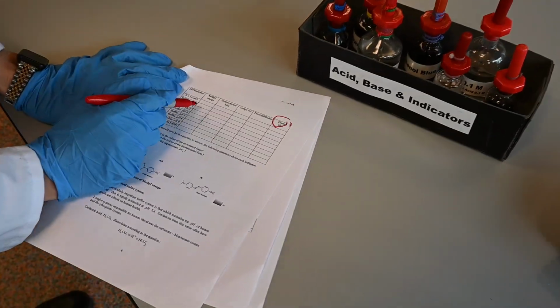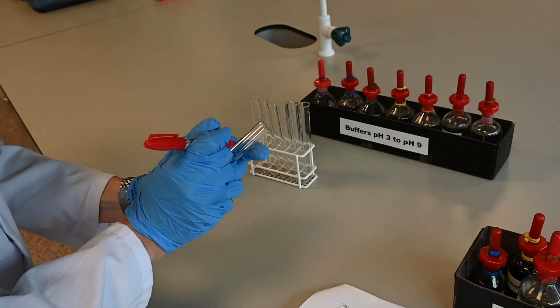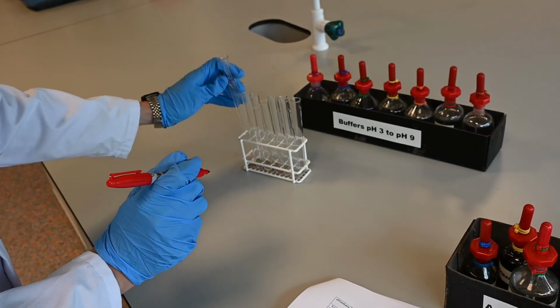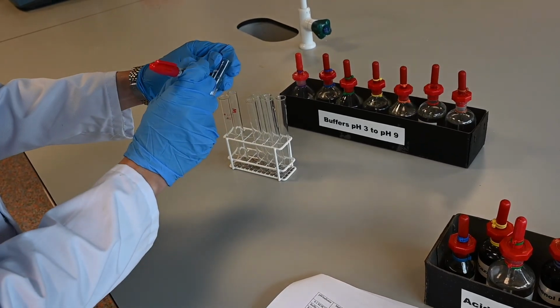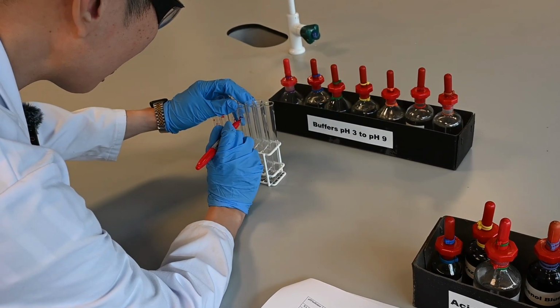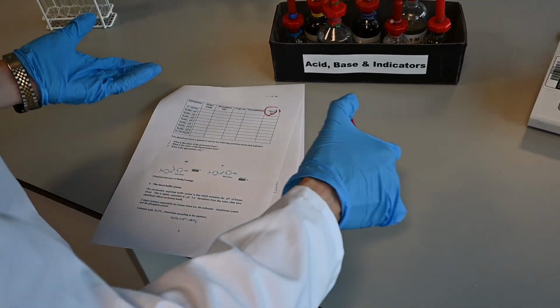And then we have different pH. So I go like, okay, this is 0.1 M HCl. Put it here, and the next one will be pH 3, the next one will be pH 4, the next one will be pH 5. You see what I mean here? Very simple. Next step, you just have to add accordingly.